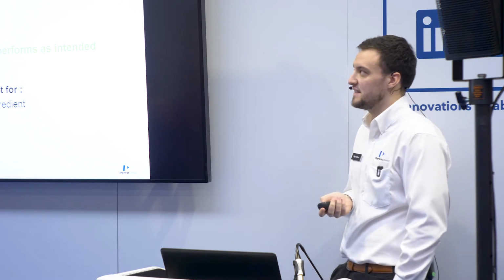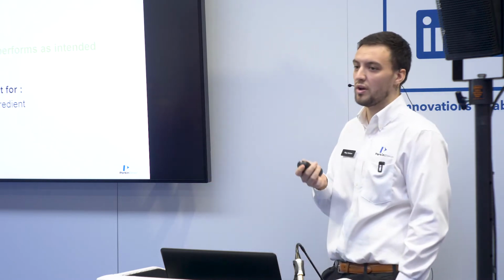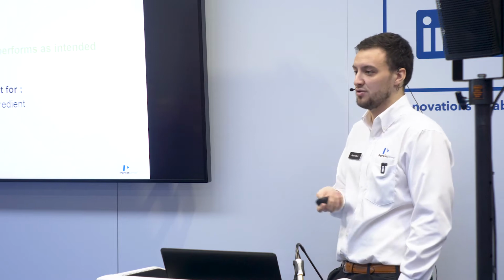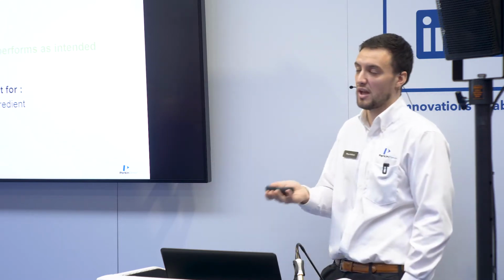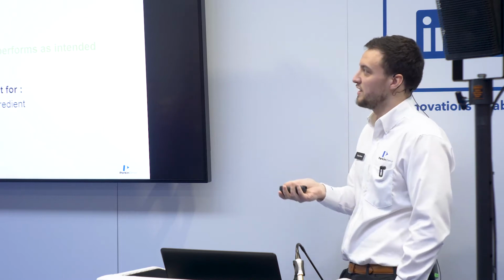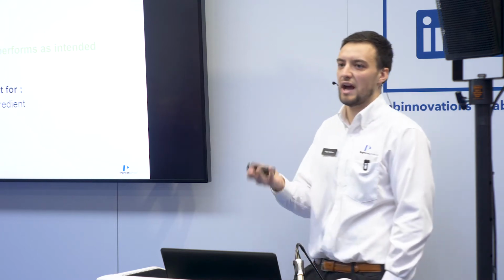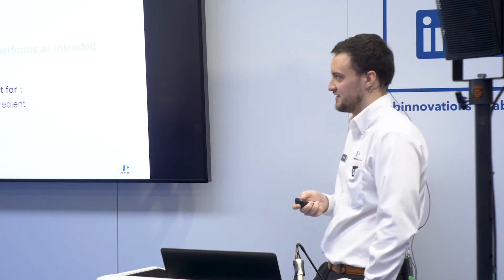The other one is the concentration of the active, the API. So when you're being prescribed different drugs, you need to make sure that the dosage that you're being given and you've been told to take is actually as it should be. And the last one as well is size distribution. So size distribution of the tablet. Again, it allows you to be able to identify any issues when it comes to your manufacturing processes.